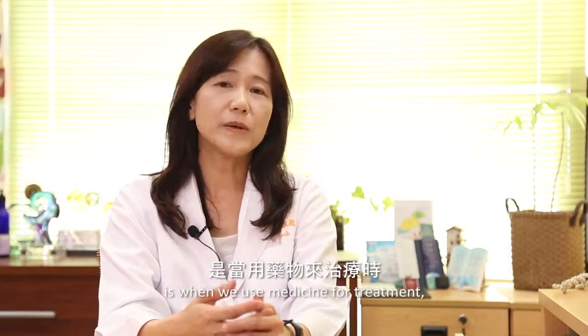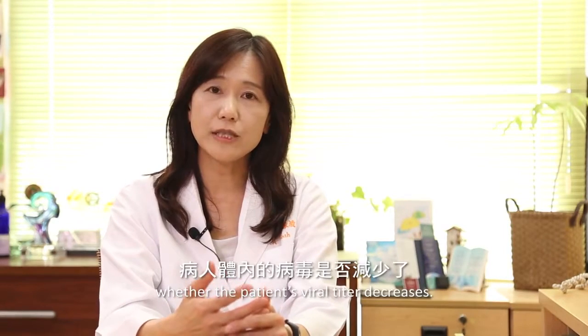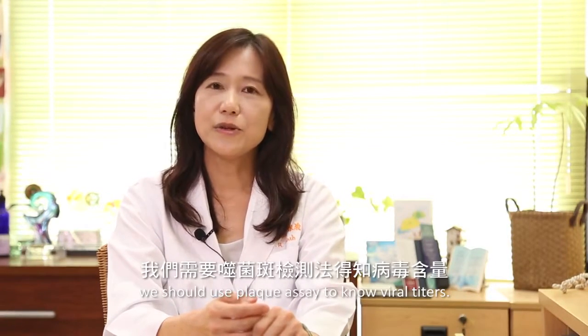Another thing is when we use medicine for treatment, we would like to know whether the patient's viral titer decreases. If the virus decreases, it indicates the medicine can work. This is why we should use plaque assay to know viral titers.